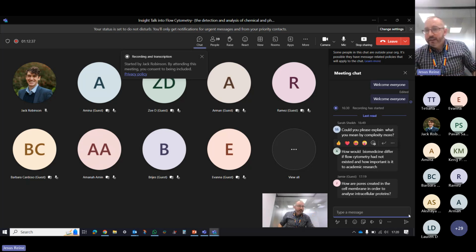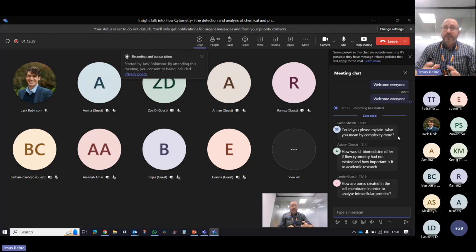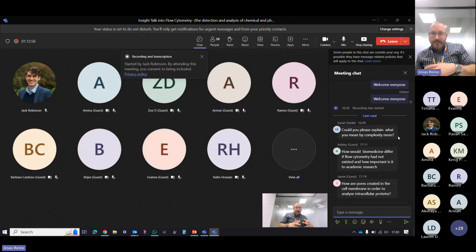The thing is that this can be applied to different kinds of things. It's not the same, a bacteria, a monocyte, a lymphocyte, and they can be very easily stratified based on these two parameters. I would say the same about algae. Most of the algae are discoidal forms, not spheric. So even the complexity is different. There are different ways to interpret this, but basically it's about how granular the cells are on the surface.